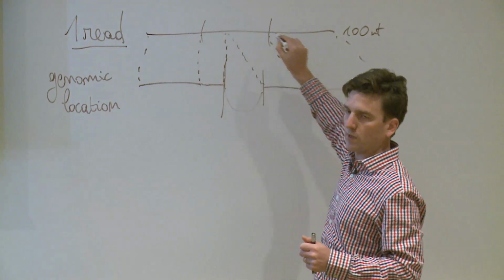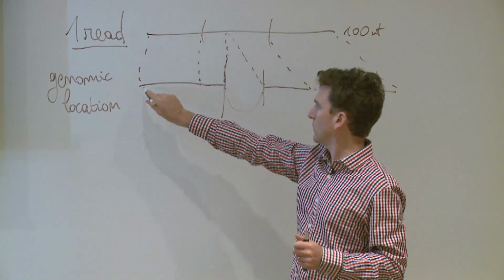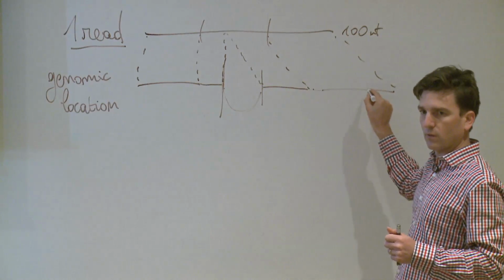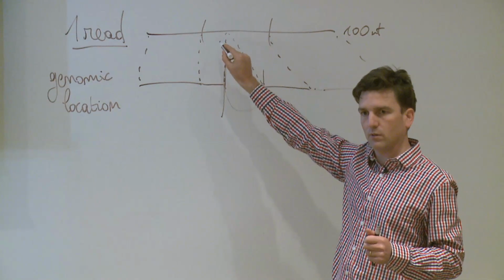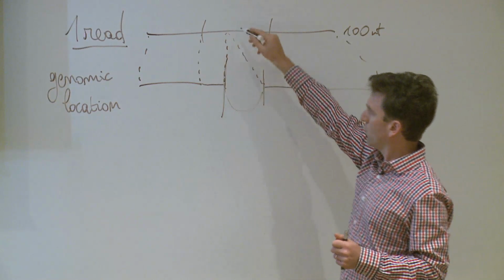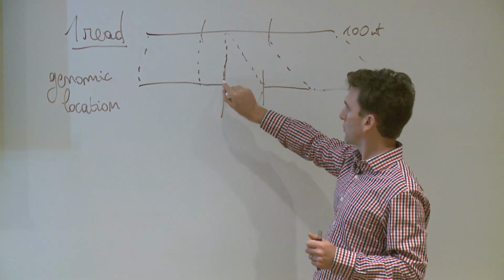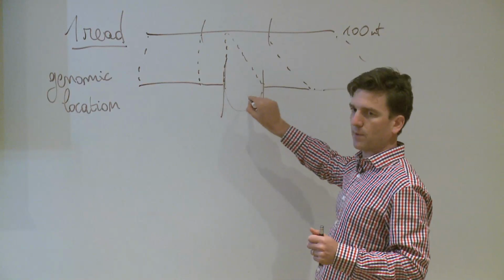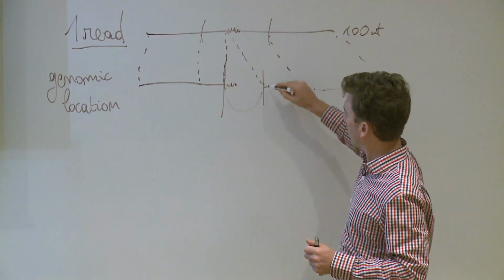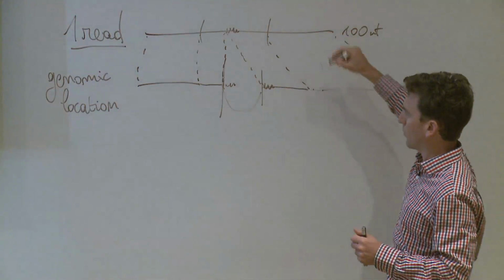So you split the read into pieces, right, and then you map to the genome. That piece here will map perfectly to that location in the genome. The end of the read will map perfectly to the genome, but that one won't map perfectly. There is no location that matches for this one. You will make it match by extending the read up to a certain location, and after that it stops mapping. So the part that is here won't map here; it will only start to map here. And that one you get by extending the end portion.